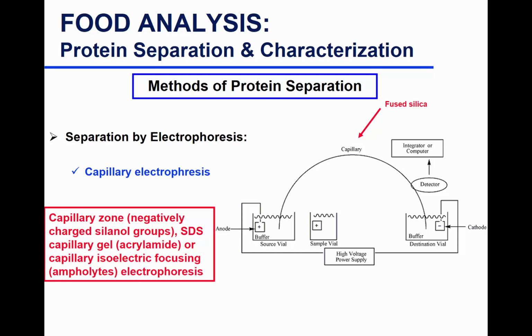It seems like it's similar as if you have a chromatography with a column, but instead of a chromatography, it is electrophoresis. So then samples get separated, and after they get separated, they go to the detector and you measure them. Detectors can range from UV detection to light scattering detector or pulse detector. So any detector that we've talked about that works for HPLC will work for capillary electrophoresis.